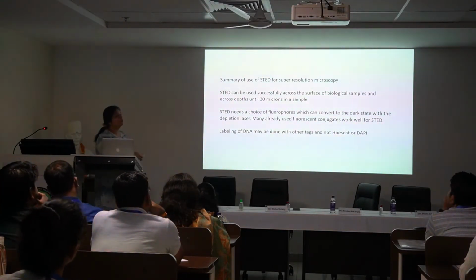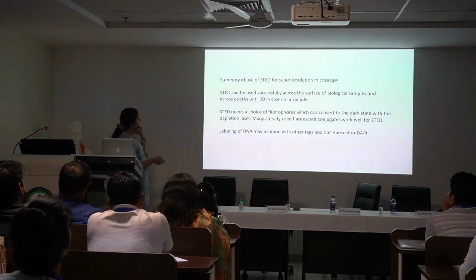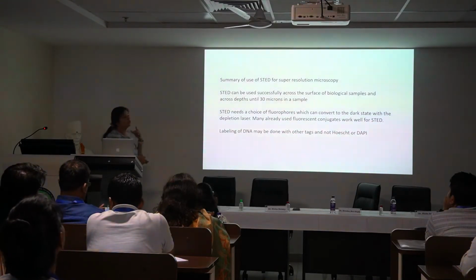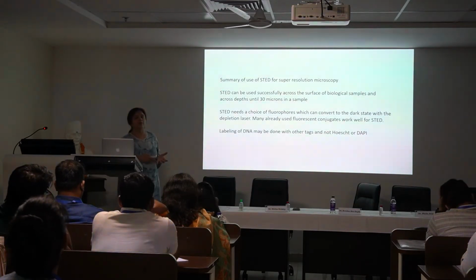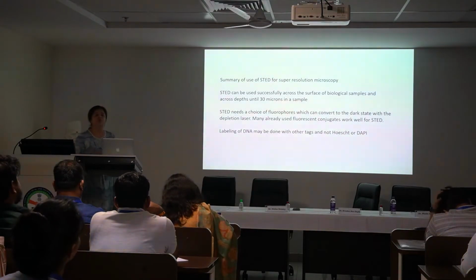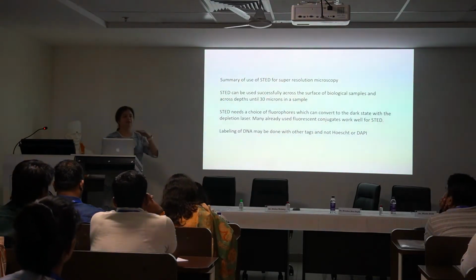So, just to summarize what we have, we think STED is good for, and also some of the literature supports it as well, is that it can be, first of all, successfully used for many different kinds of biological samples, and that's one of the reasons why it has gained popularity, especially in places which use a variety of samples, not just cell culture, right? Because a lot of cell culture is really flat cells.